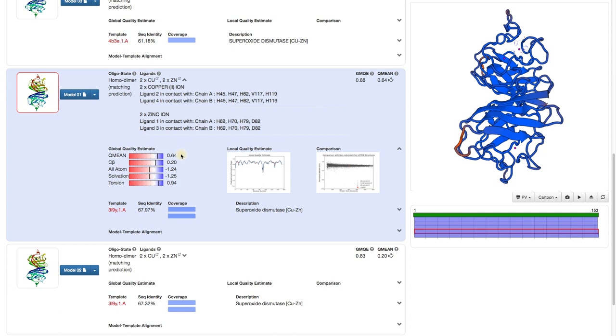Values below minus 4 are an indication that the model is very unreliable. However, usually a more important question is which parts of the model are reliable and which ones are not, and this can be seen in the local quality estimate.